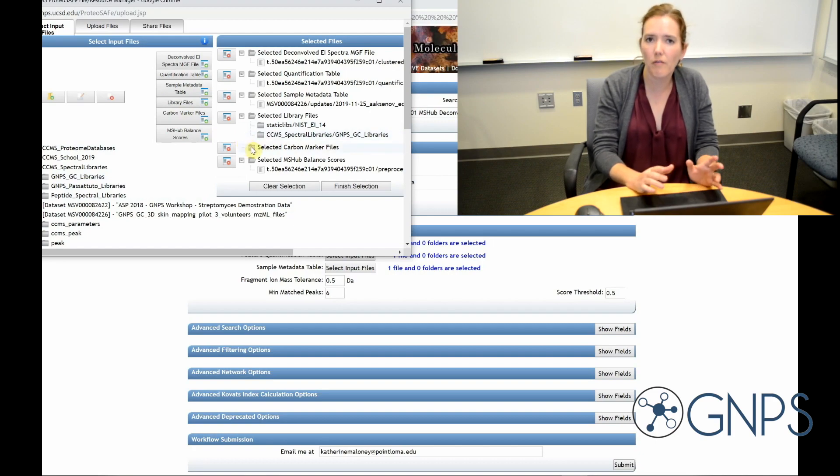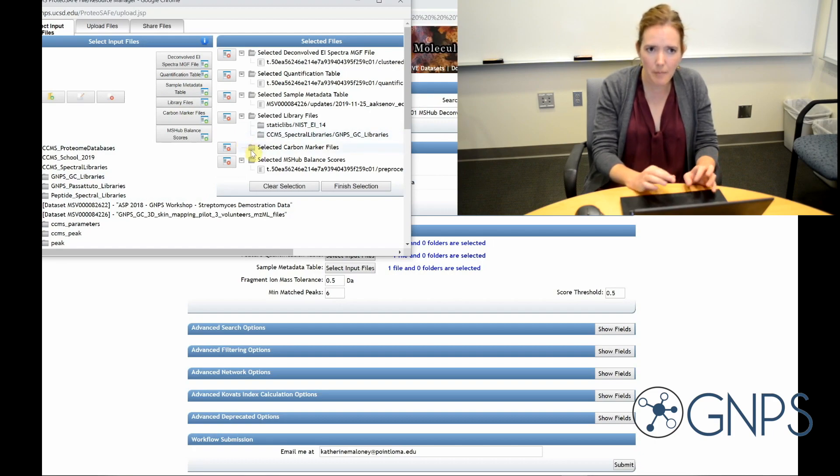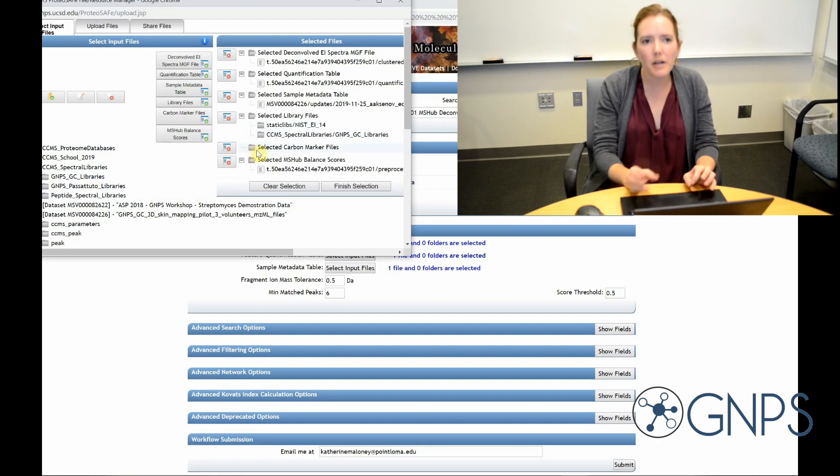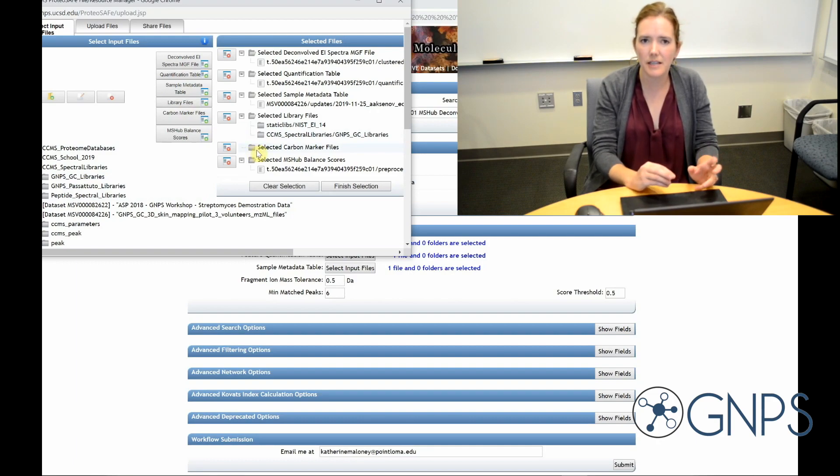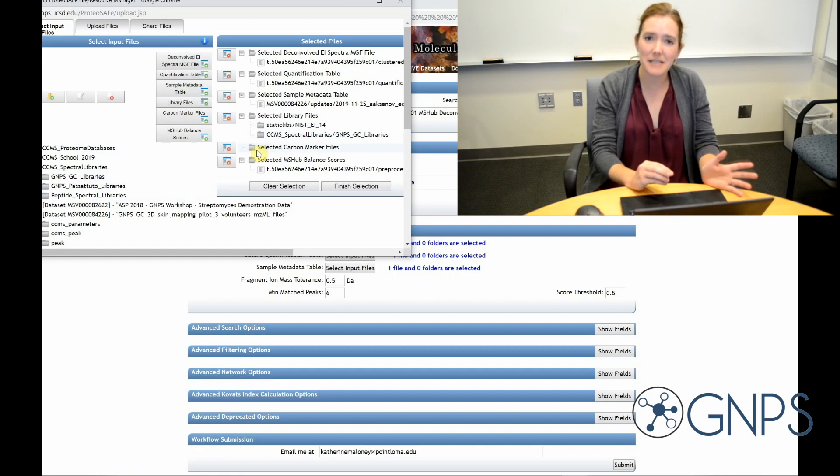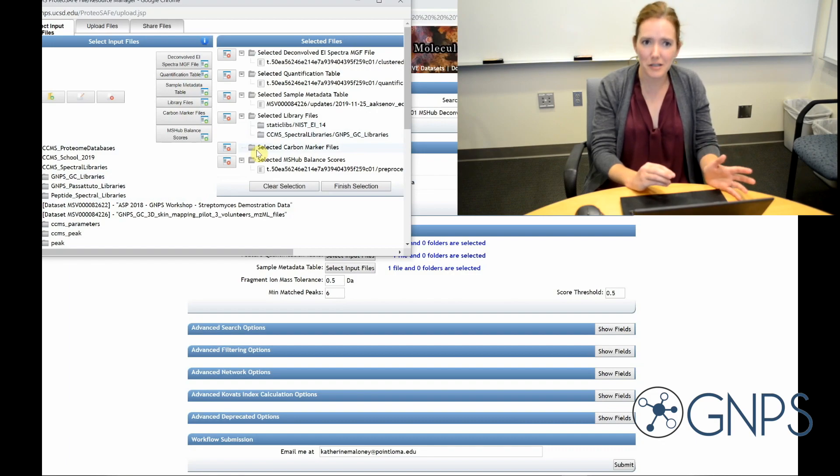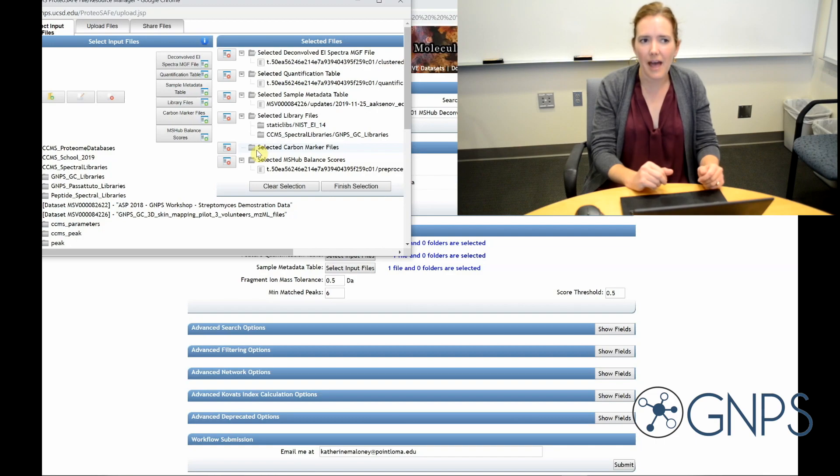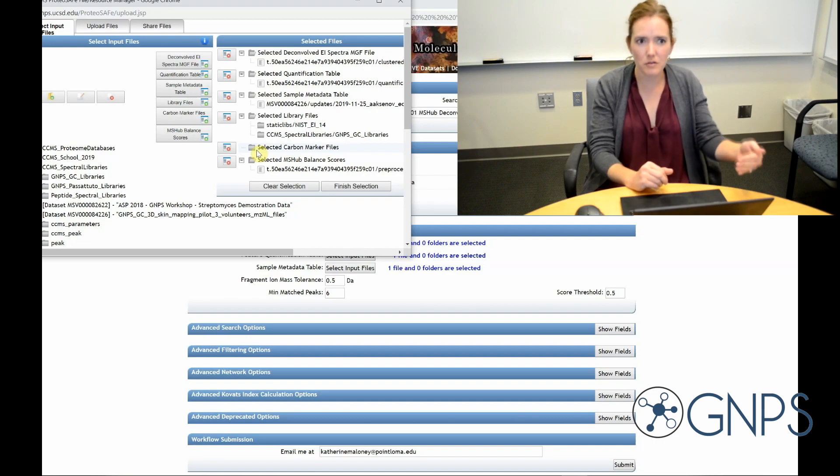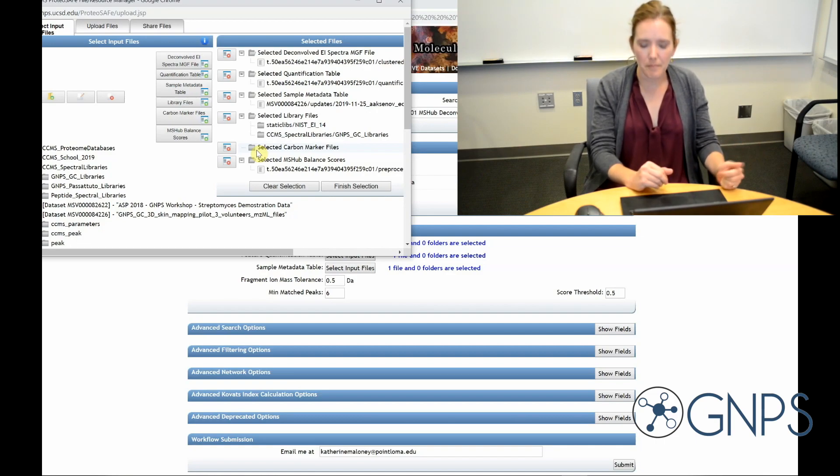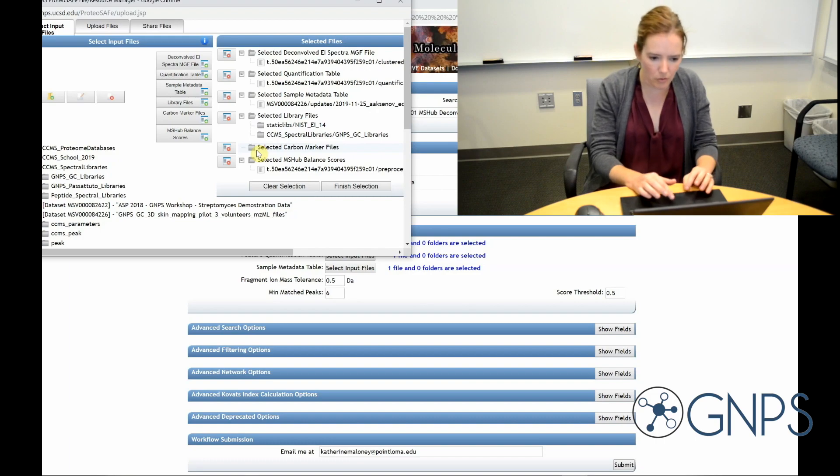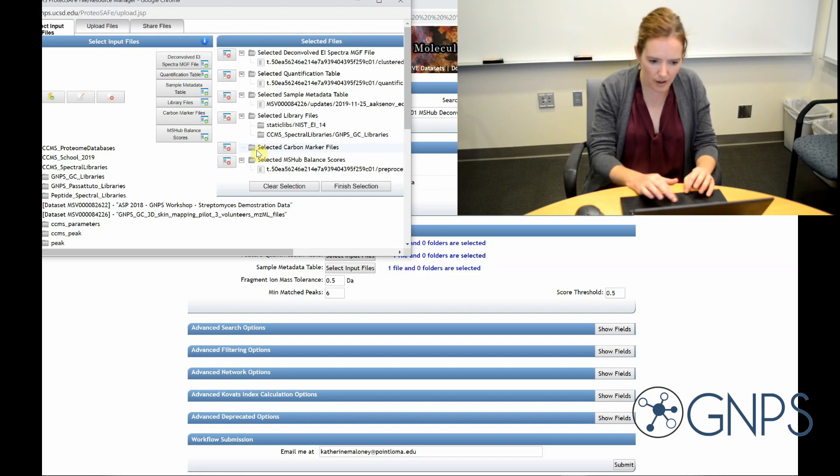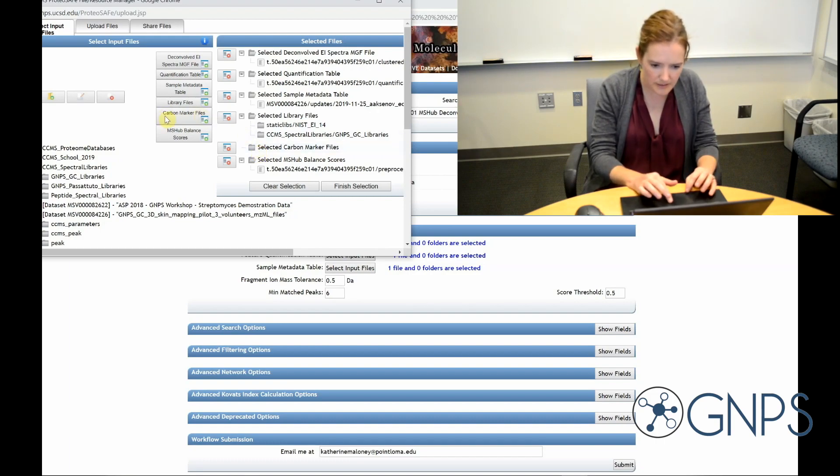And in addition, if I want to improve the quality of my library matches, I can incorporate something called KOVATS retention index into my job. And so if I wanted to do that, I would have to first run a standard mix using the same GC method as my samples, generate a carbon marker table as a CSV file that has retention information for each of those standards, and then upload those to this area. But I'm not going to do that in this case.